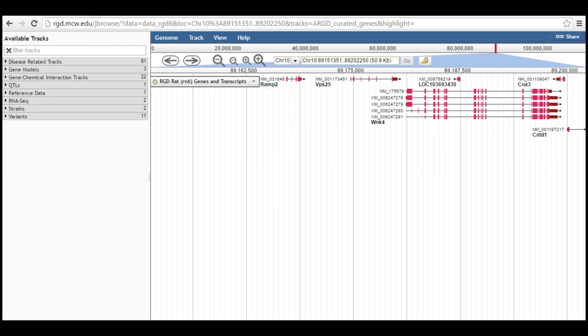The track order in the browser display can be changed by dragging and dropping tracks. Click on the track title and drag the track until a line appears at the position you want it to occupy. Then release the mouse button to drop the track there.